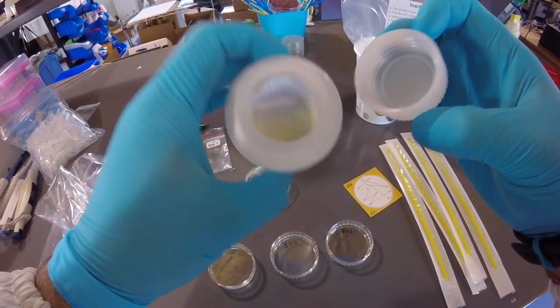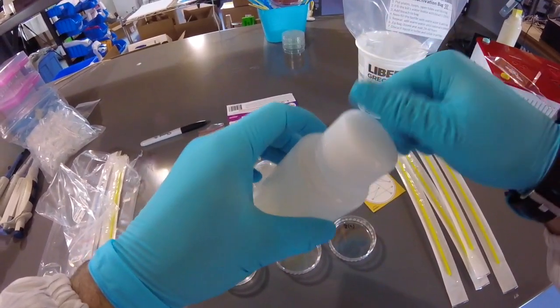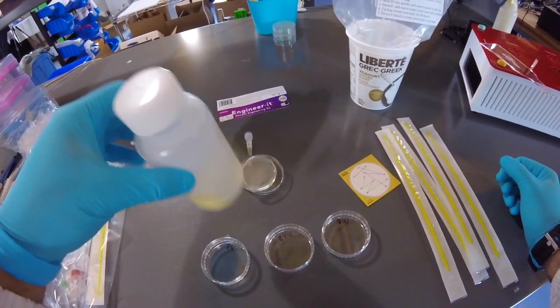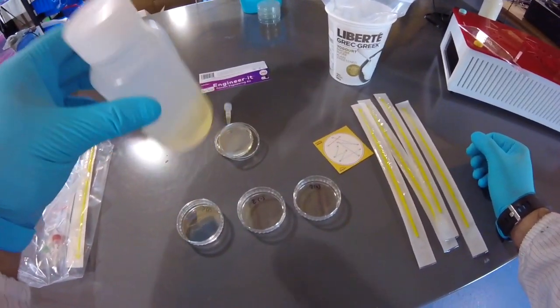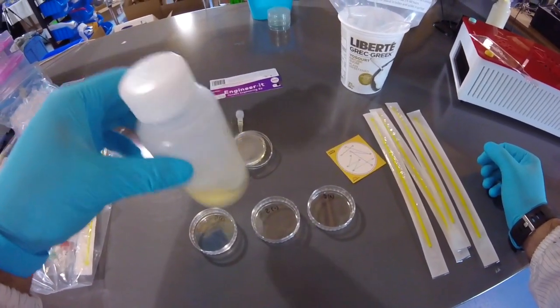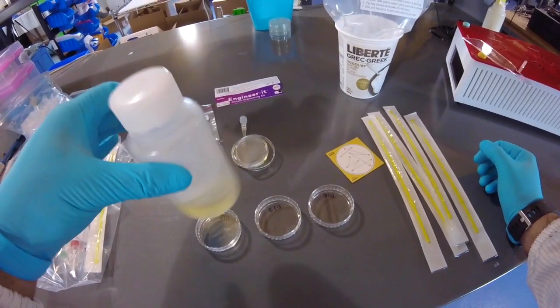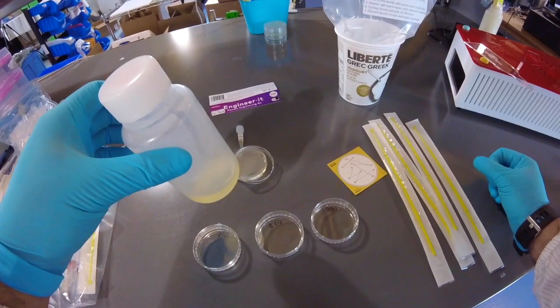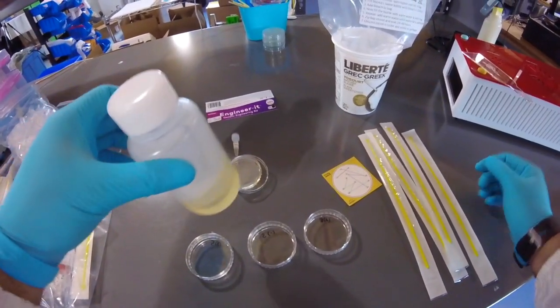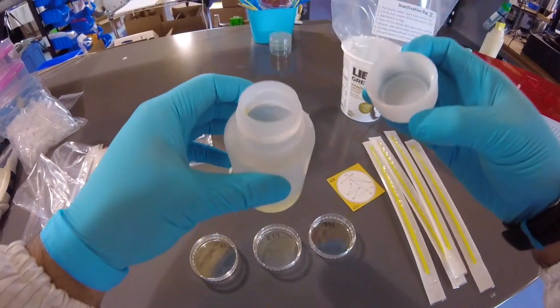It's almost dissolved. And the cooling and solidifying period really depends on your environment. If it's very humid and warm, it can take up to half an hour. If it's cool and dry, like it often gets in Canada, it can be only a couple of minutes before they're ready to go. So just keep that in mind.